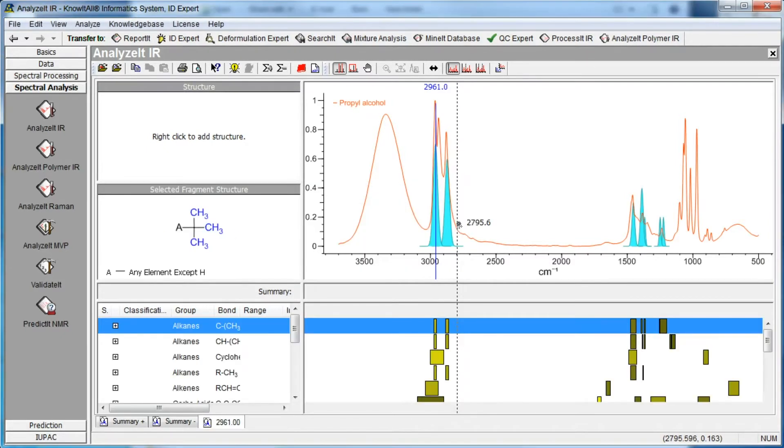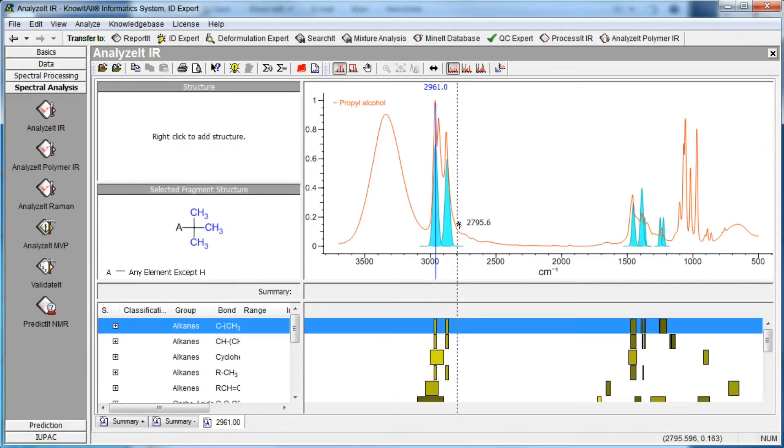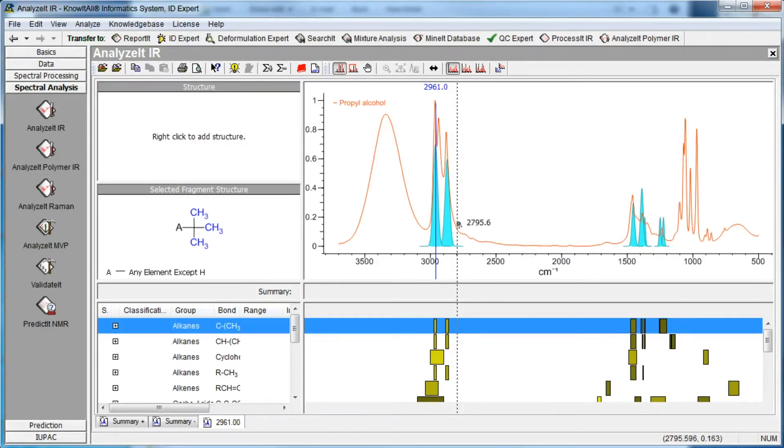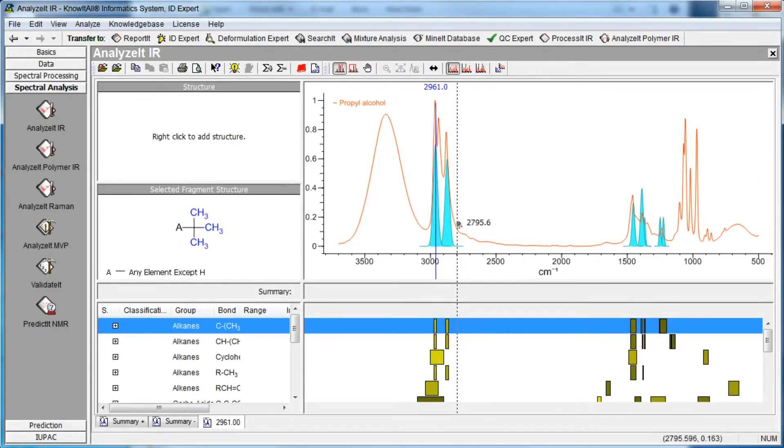The results are displayed in the main Analyze-It window. We have selected the first entry in the functional group data pane and the corresponding fragment structure is displayed in the structure pane. The spectrum window displays the spectrum along with the bands from the highlighted functional group.